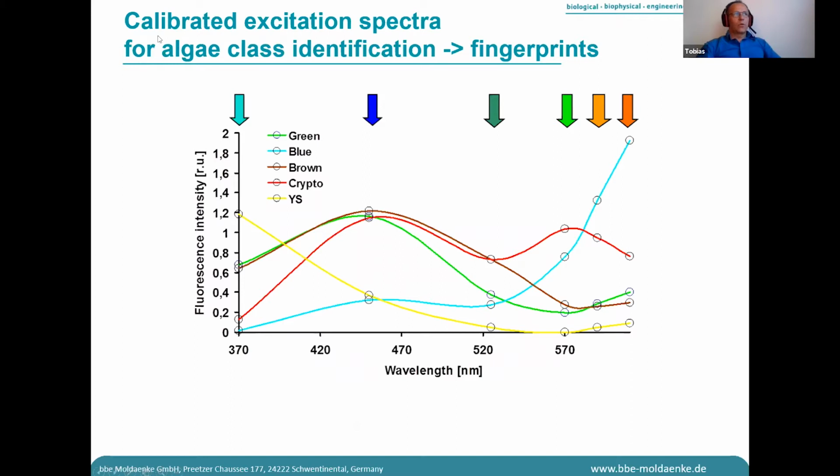What the main focus is, we calibrate excitation spectra. So we calibrate the algae with pure algae solutions. And for algae identification, we call them fingerprints. Those are the fingerprints of the different algae, where they get excited, the exciting wavelengths.